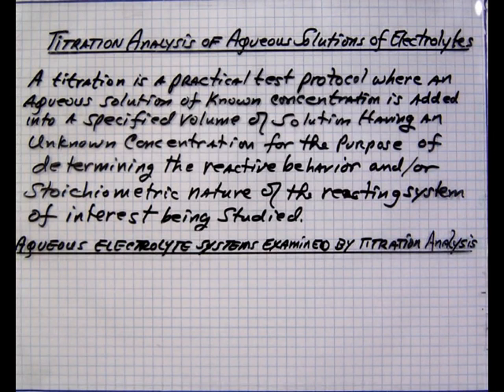Now, I'd like to look at some aqueous electrolyte systems that are examined by titration analysis.